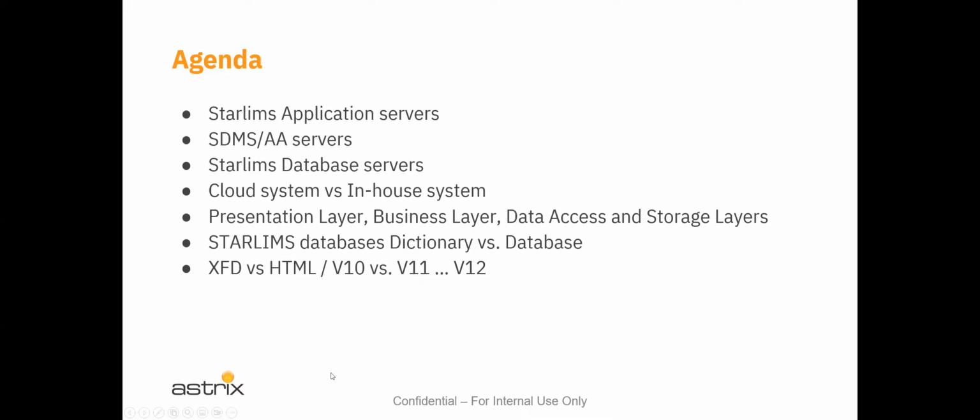And by the way, this is the first time I actually use a new feature that I know of anyway regarding how to highlight on the screen. Can you all see my mouse? Yeah, we can see it. Oh, I see. Maybe it wasn't necessary because I have this other thing that shows like a laser pointer now. It's red. Can you all see that? Yeah. Okay, excellent. All right.